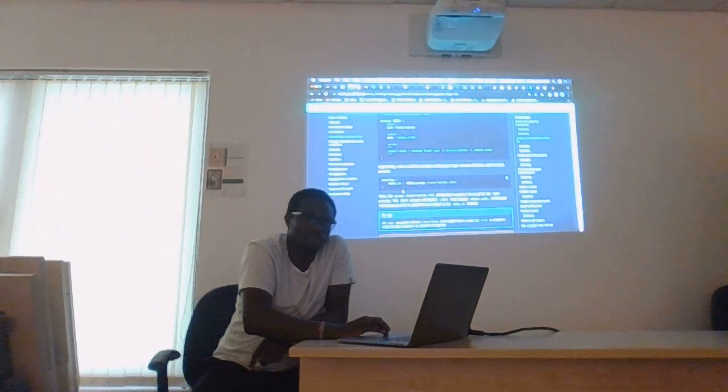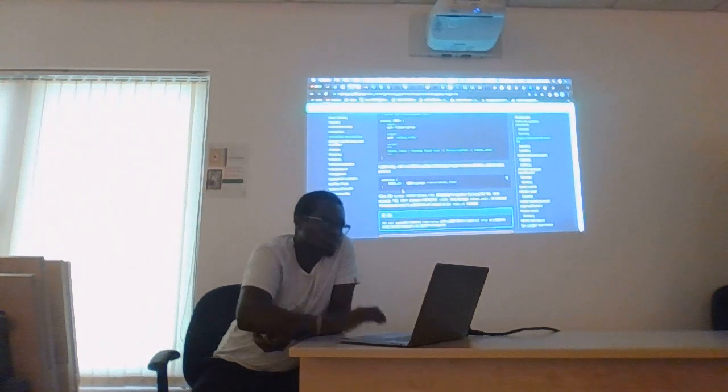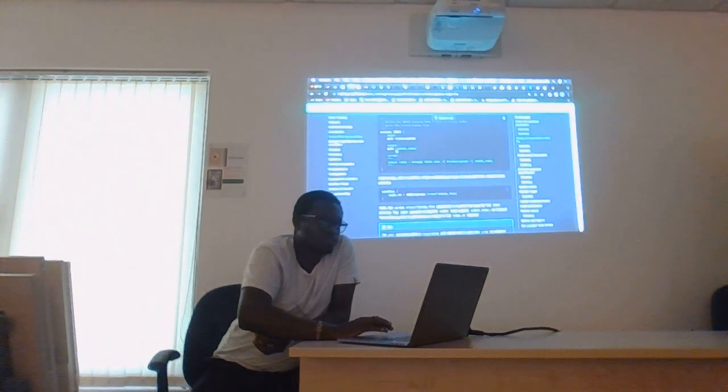Excuse me. So inside the process, there's input and output. After input, it can be a value or it can be a file. So how can I determine whether to use a value or a file? That's a very good question.